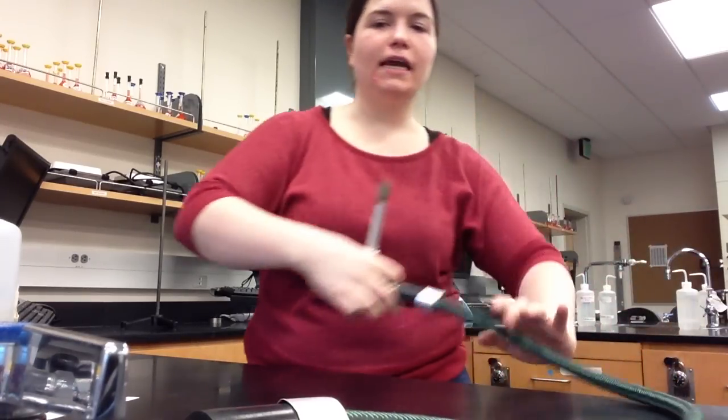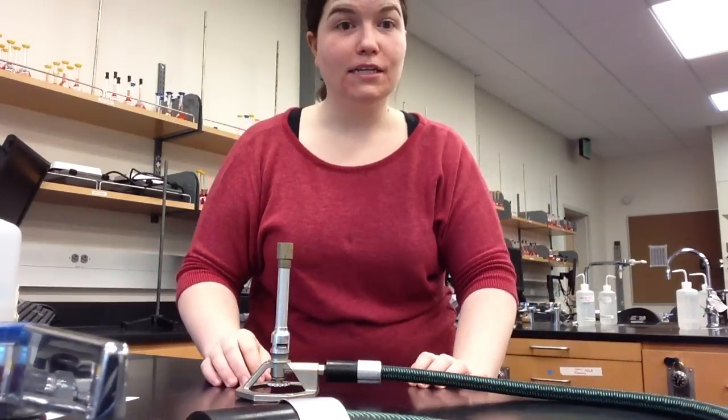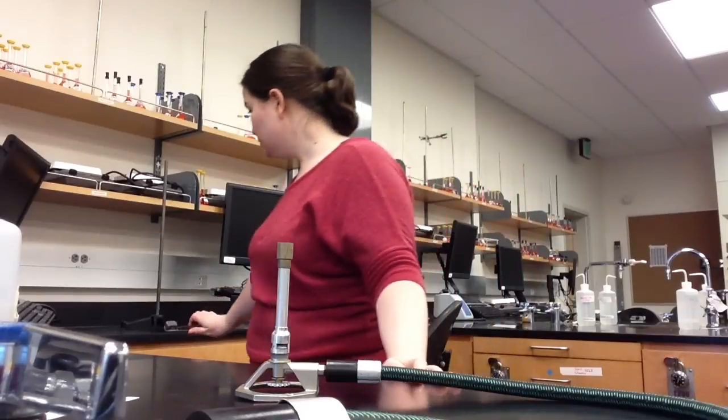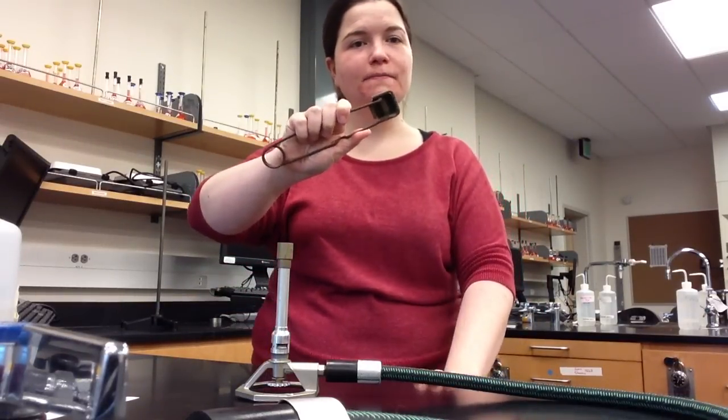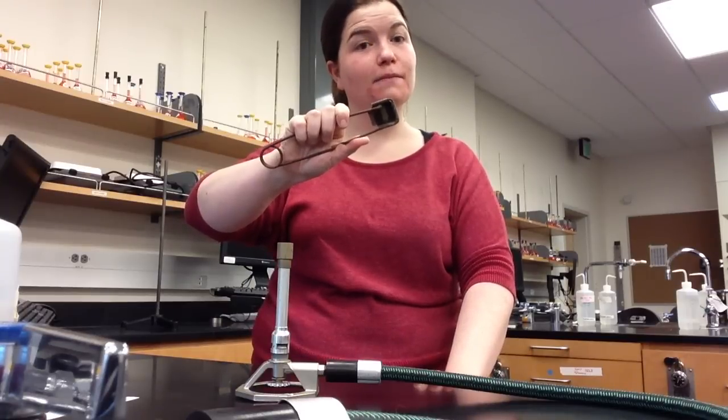Before I can turn on the gas valve, I first need to get a striker out of the lab drawer at the end of the lab bench. This striker will produce a spark which will ignite the gas coming out of the Bunsen burner.